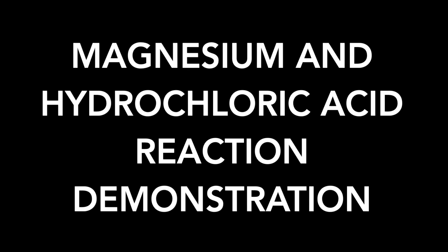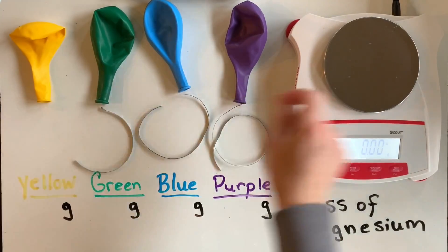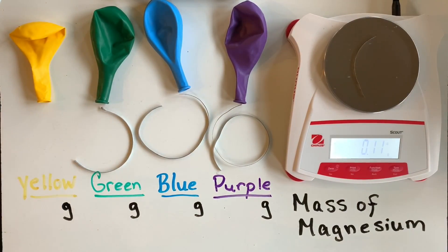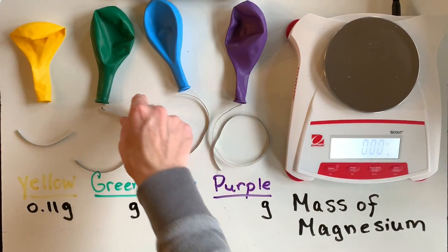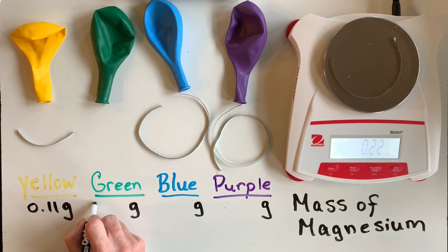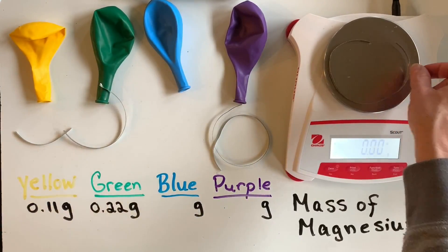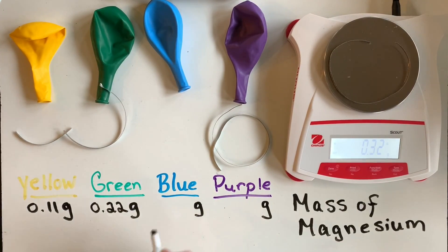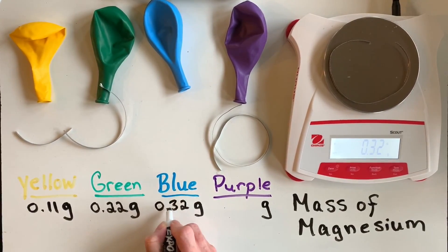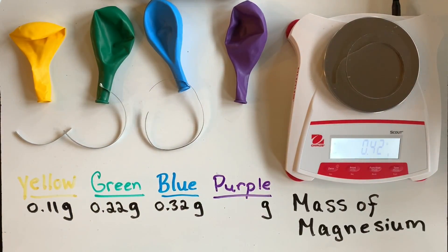In this video you're going to see a demonstration of magnesium reacting with hydrochloric acid in solution. The first thing I did was I varied my magnesium samples by about 0.1 grams. My first sample, placed into the yellow balloon, weighs the least or has the lowest mass, and the largest mass will be placed into the purple balloon. Those samples will then be dropped into the hydrochloric acid solution and allowed to react.